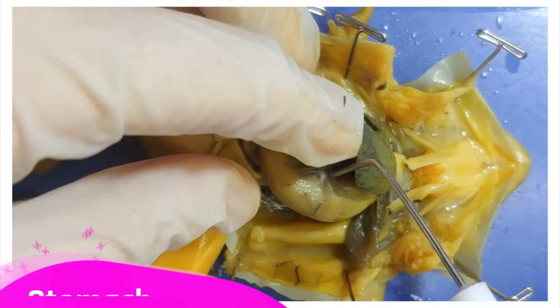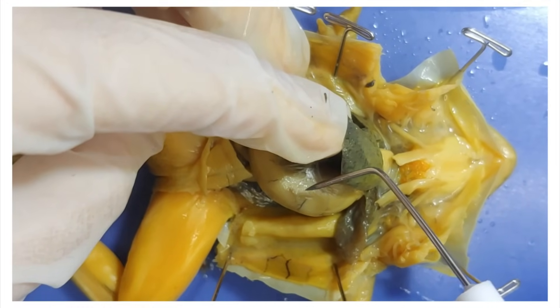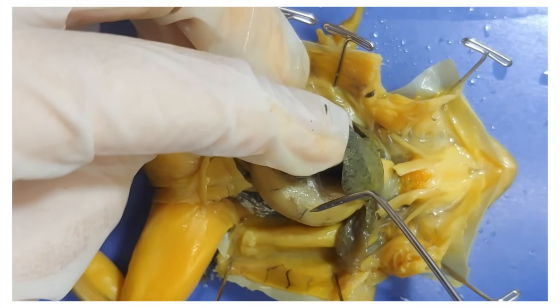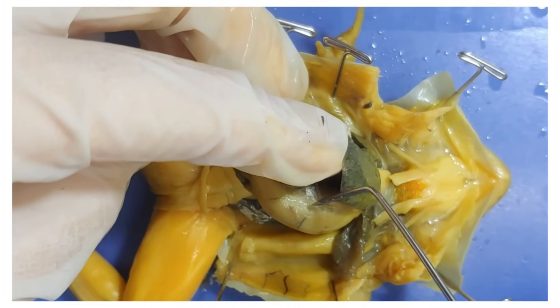Down here is the stomach, which stores and digests food. One interesting fact: frogs can't throw up like us, so if a frog eats something poisonous, it just throws up its entire stomach — turns that thing inside out like a sock — and then scrapes it clean with its front feet. Mannerism, alright?